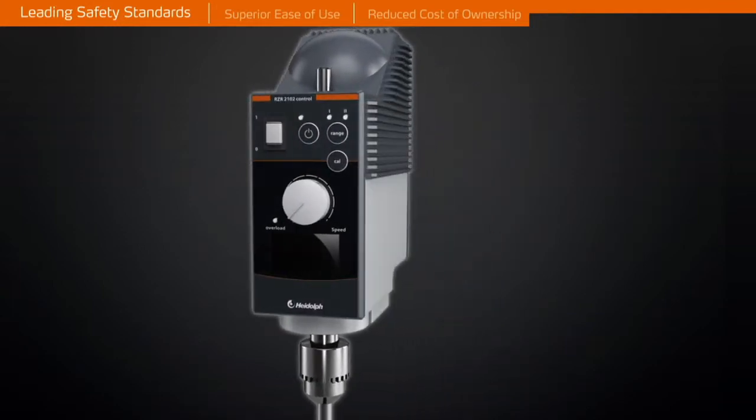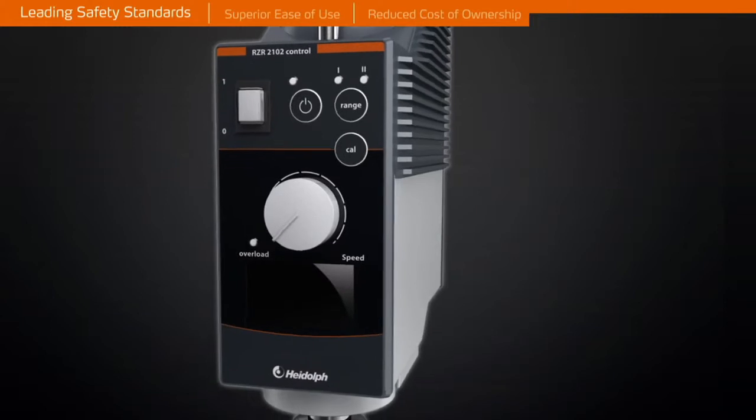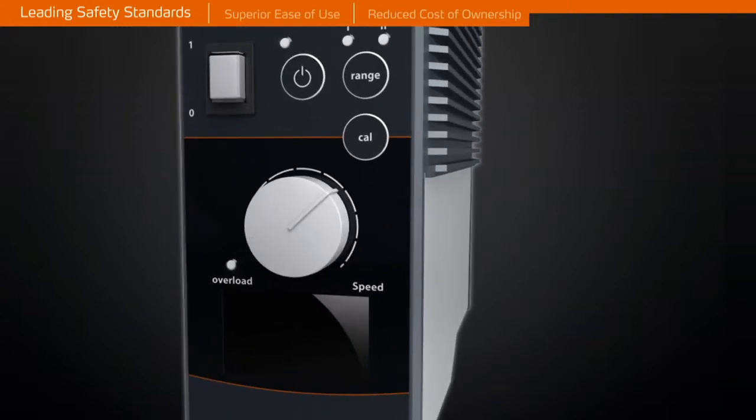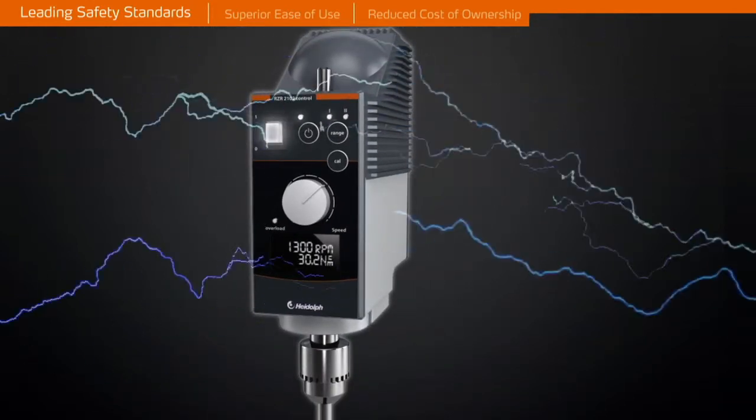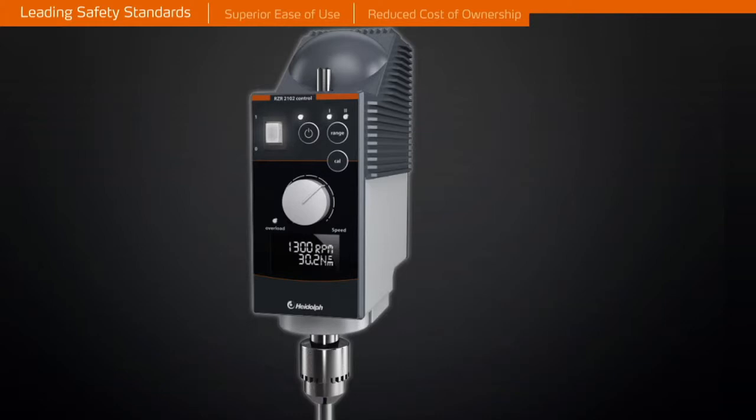The motor will be switched off if a thermal load situation occurs to provide superior operator safety, especially during periods of unlimited continuous operation. Additional safety, especially in flammable environments, is provided by sparkless motors.